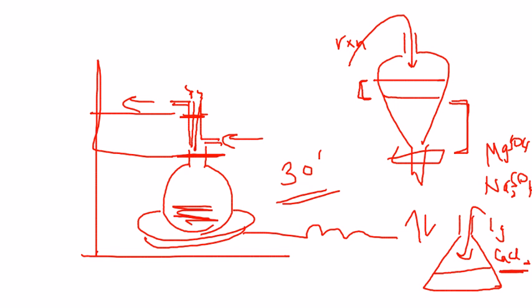On the other hand, a lot of times we see that the drying process rather hasn't quite worked, and so in that event you would have to add 2 boiling chips and carry out a simple distillation to collect the fraction that boils between 100 to 110 or so. But like I said, most people are usually done with that.